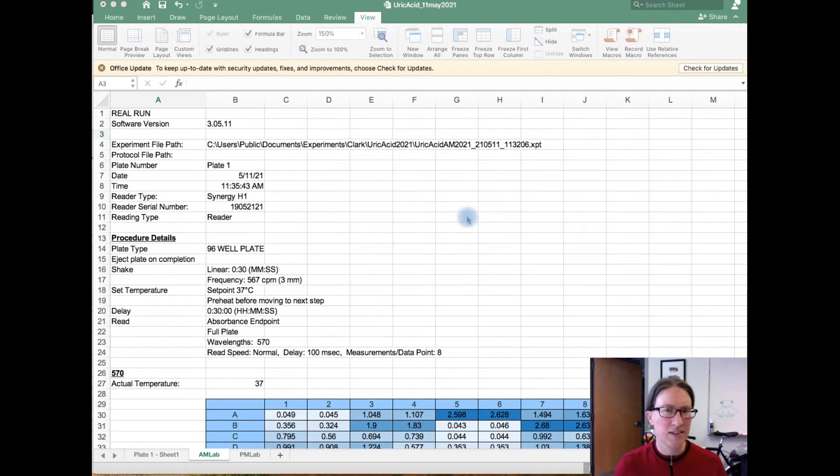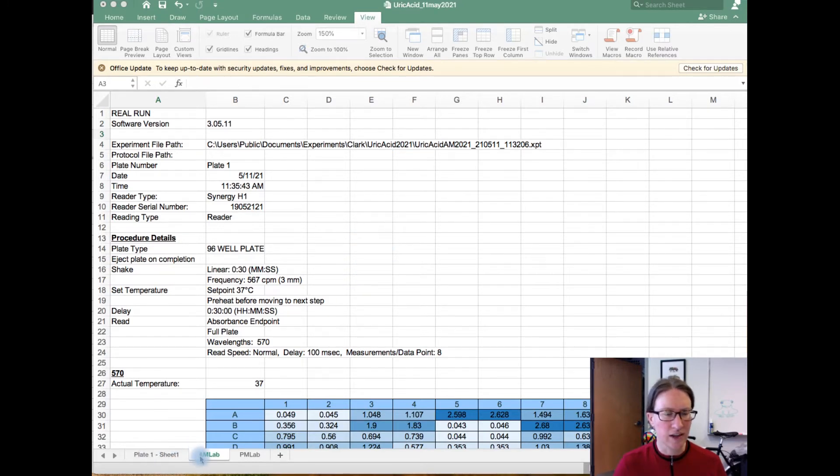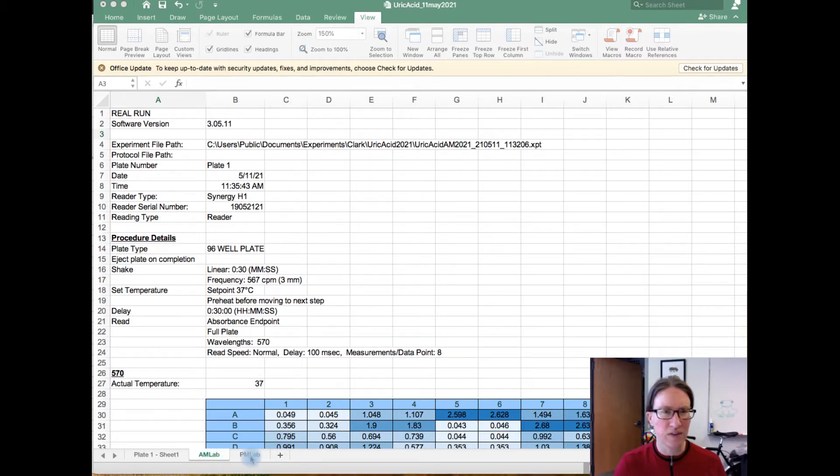So here's the Excel spreadsheet that gets exported, and you'll see a link to this on Canvas. I ran one initial test, we're going to ignore that, and so there will be two tabs, one for the plate from the morning lab and then one for the plate from the evening lab.